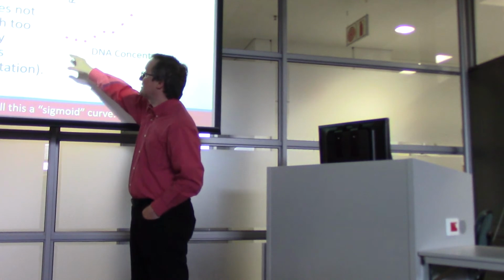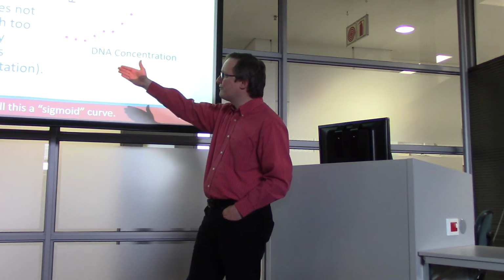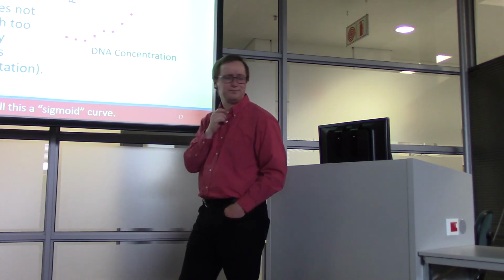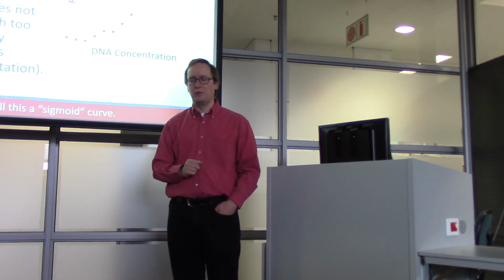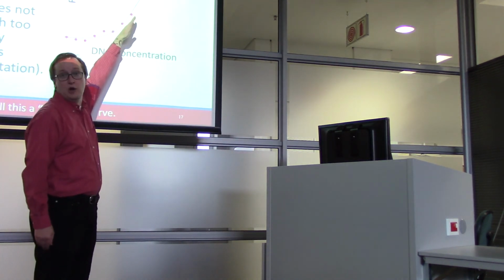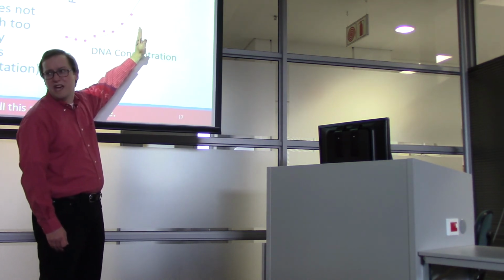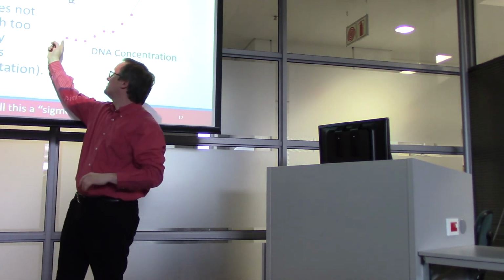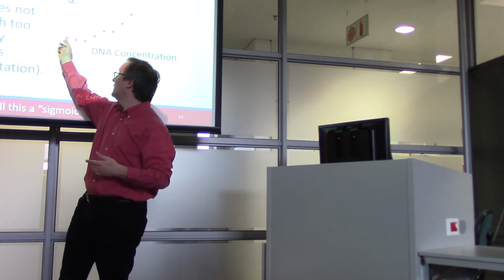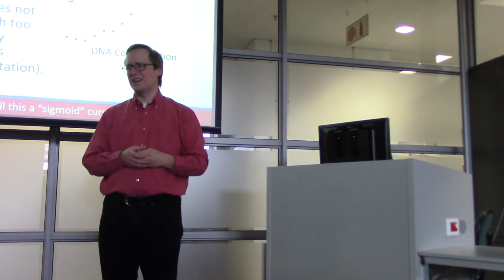Next. And this is an important one, I think, the level of quantitation: read count does not rise linearly with too few or too many sequence copies. There is a strong temptation for people working with quantitative technologies to always assume that this slope, this spot in the middle, is where your data must fall. You shouldn't assume that, though, because if you have too few copies, you're not getting an increase in what your detector says from these very small counts. And up at the top, you have this kind of blatting, right?